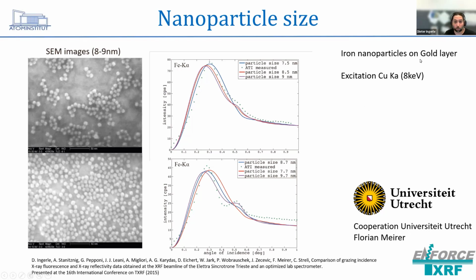And in this case, we deposited on a gold layer just to extend the angular range a little bit. I think that's a similar idea to what maybe Manoj Tiwari showed you with the multilayer. So deposition on multilayers. In this case, just because it's easier and cheaper, we used a gold layer on a wafer, which you can readily buy, and just deposited these particles on these gold layers. And you can see here, this also fits.